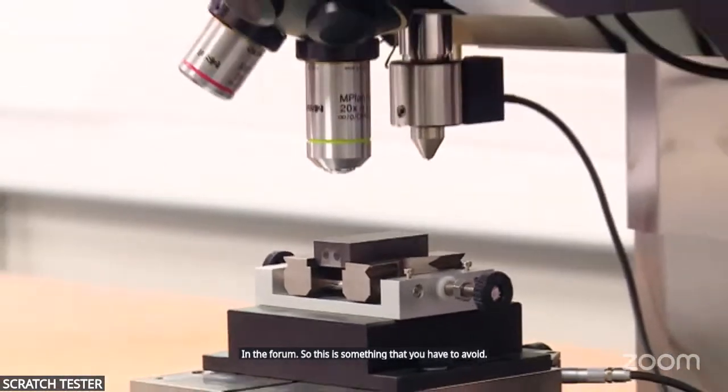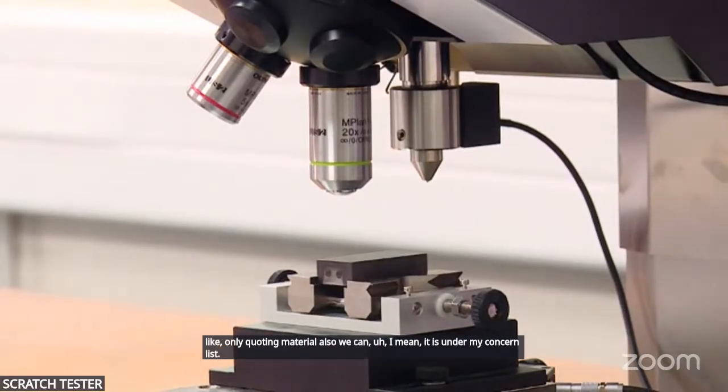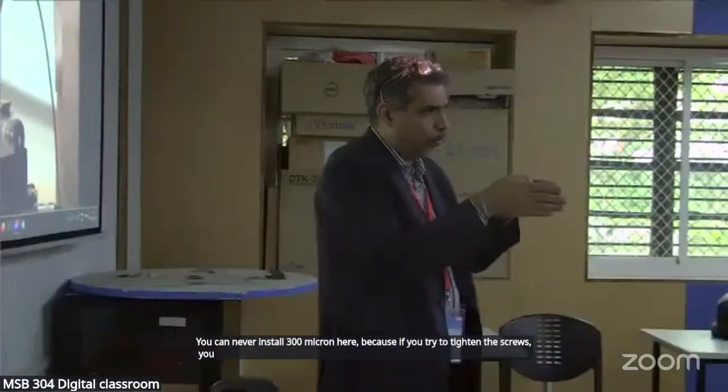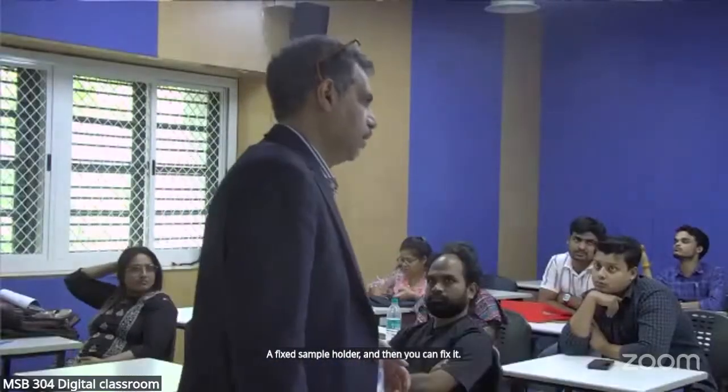If it is a standalone coating material of 200 or 300 microns, then an issue will arise. For a 300 micron sample, I will glue the sample on an aluminum sample holder. You can use super glue, fix the sample, and then test. You can never install a 300 micron sample here, because if you tighten the screws, you will deform the sample. But you can glue it with super glue on a fixed sample holder, and then fix it. Okay?